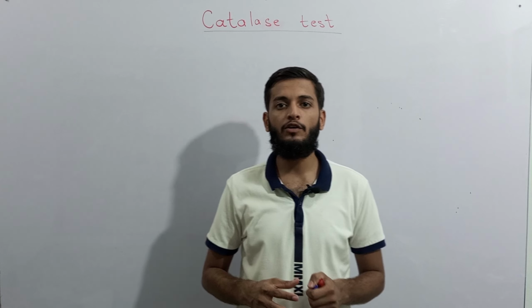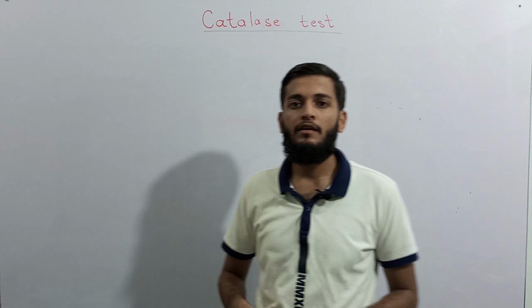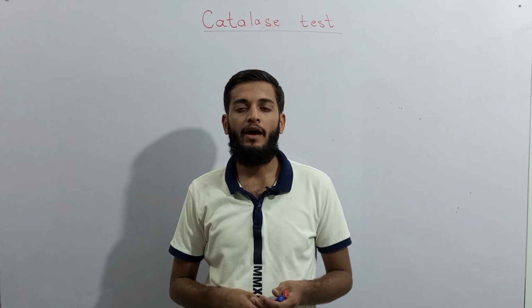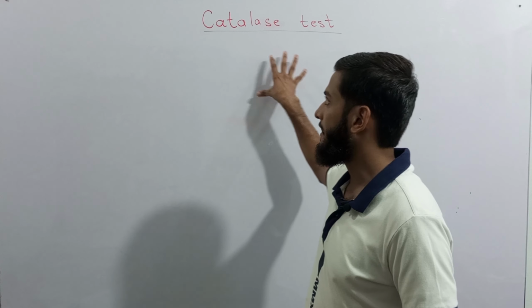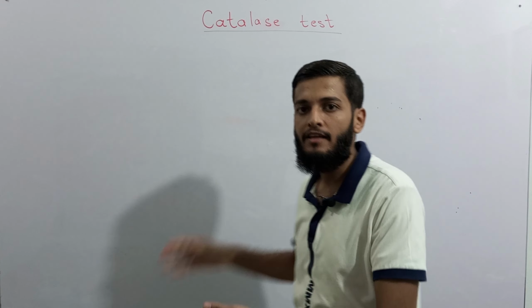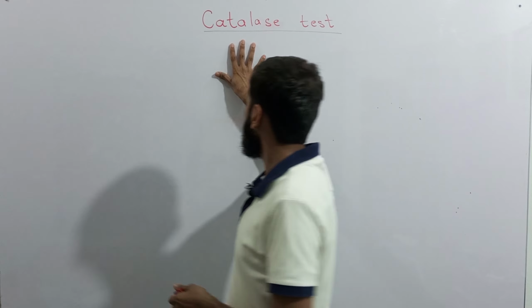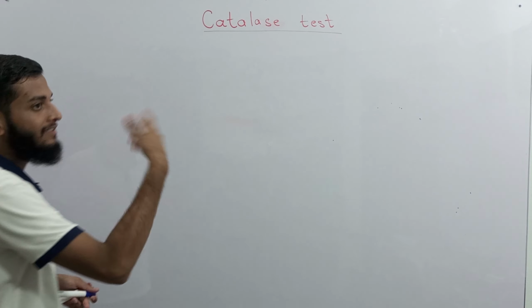In this video, we will talk about catalase test. Catalase is an enzyme, and catalase test detects whether a bacteria carries catalase enzyme or not. So, catalase test detects catalase enzyme.